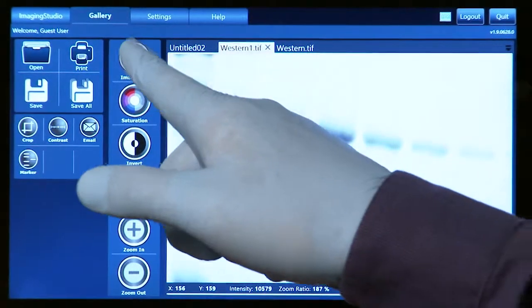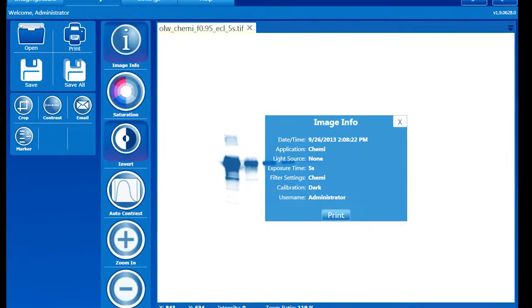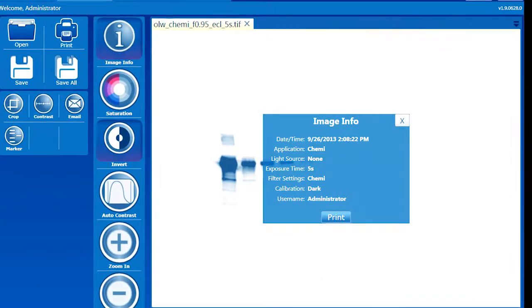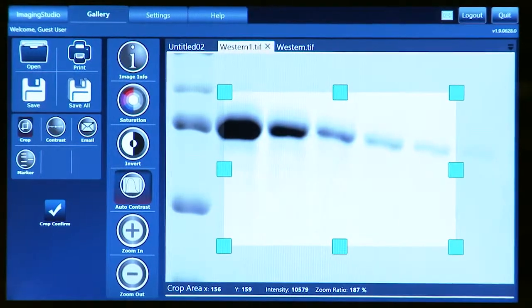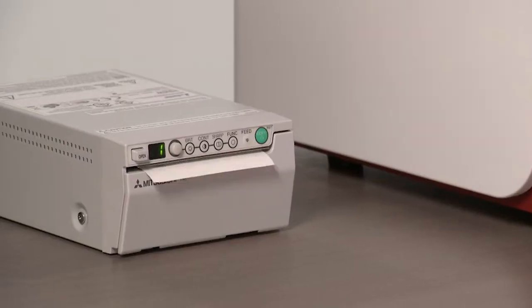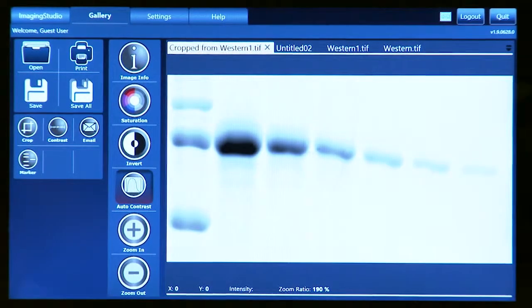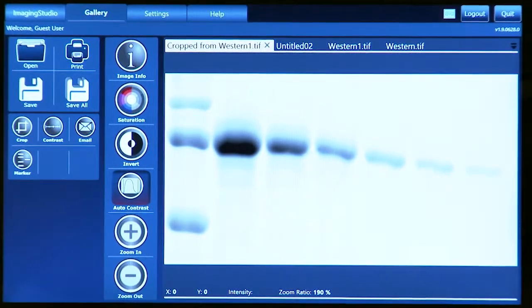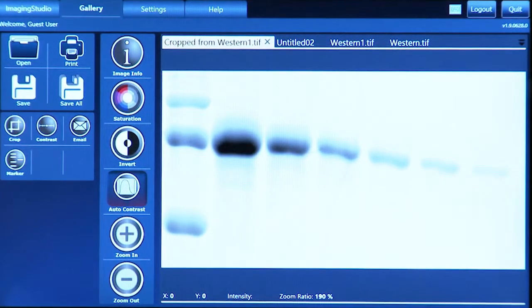The Image Info button shows you information about your image, such as when you imaged it, the exposure time, and what lights and filters were used. You can also quickly crop an image, and if connected to a thermal printer, print a copy. You can select the Auto Contrast button or select the Contrast button to manually adjust the gamma and black and white levels of your image.